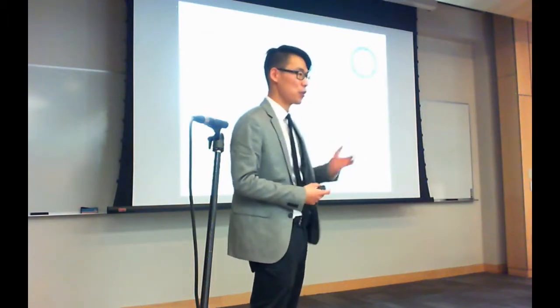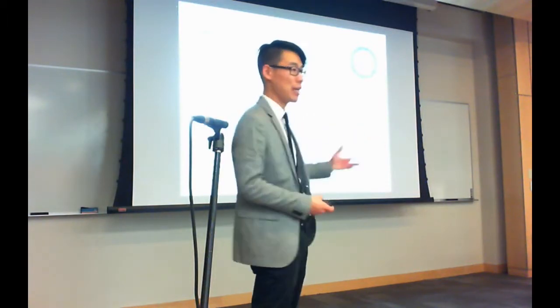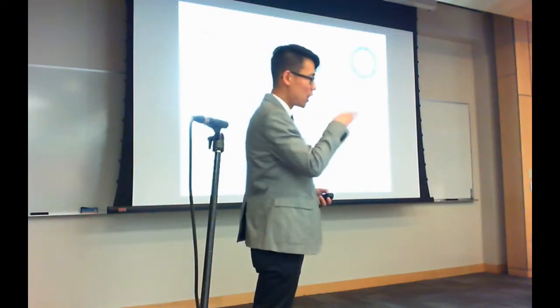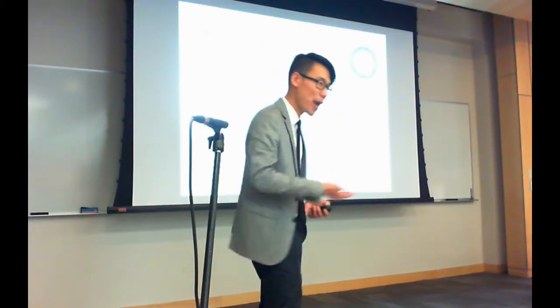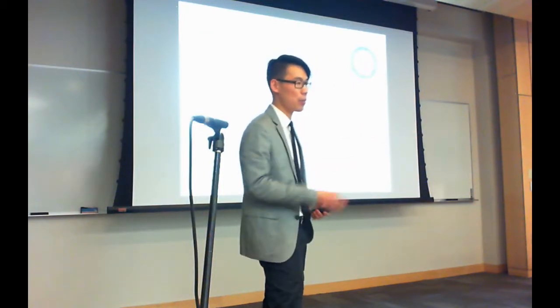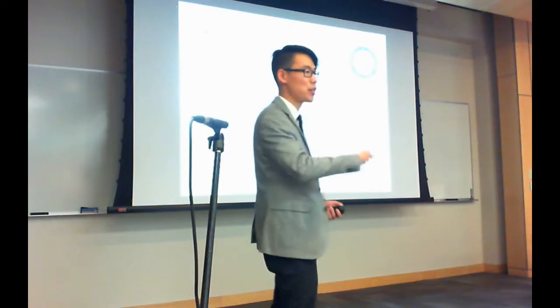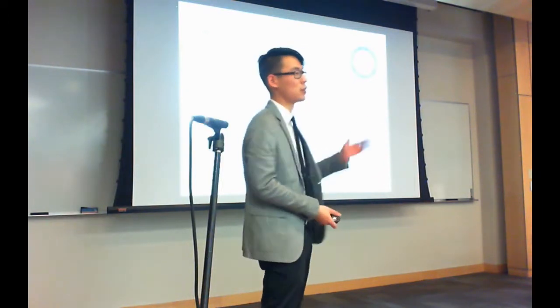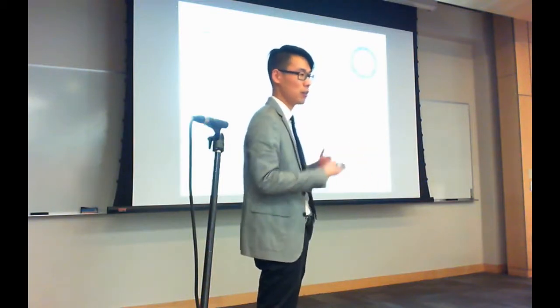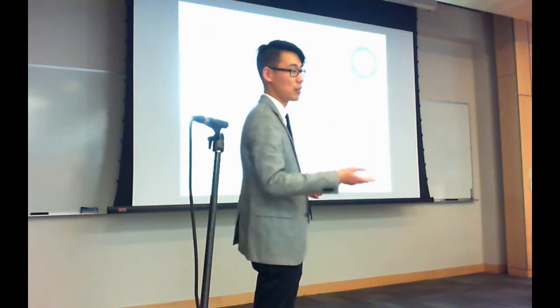And going forward, because we have all this data of identifications, we know which particular elements in our library we would expect to see more commonly. So you can assign a prior expectation for observing that particular precursor versus other rare things. If you incorporate that into your score, that might help sensitivity.